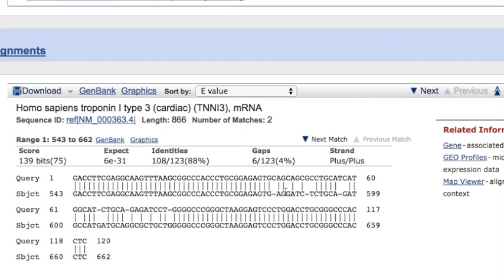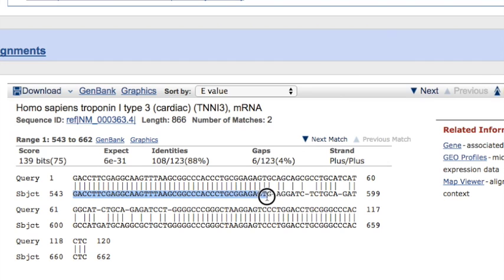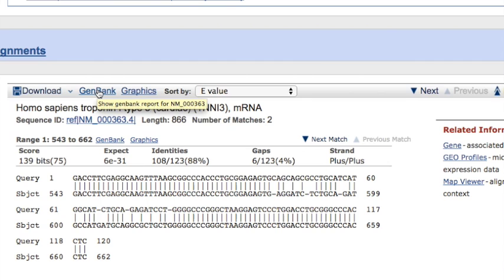So here we go. If we scroll down, we can actually see the first result. And this is again a cDNA derived from an mRNA that encodes normally for a protein called troponin I type 3 from cardiac tissue apparently. This right here shows the alignment, meaning these are in the query all of the nucleotides that we entered and searched using. And subject right here is the result.